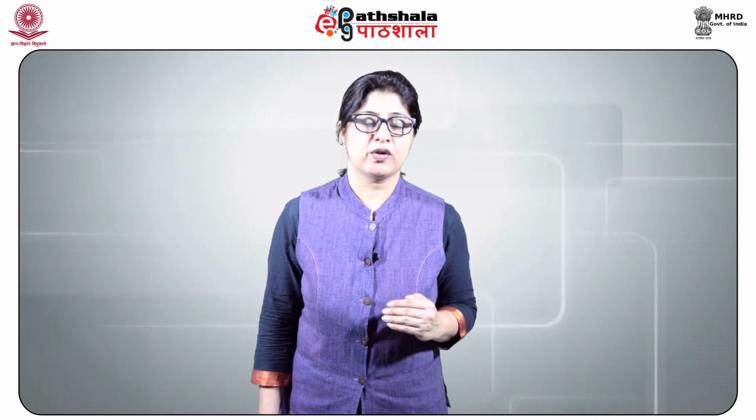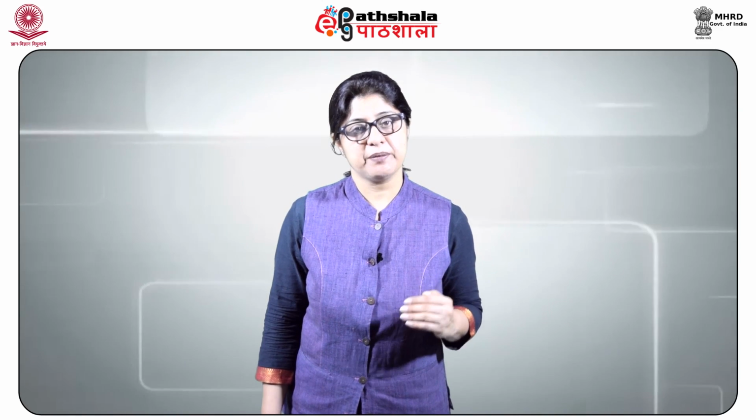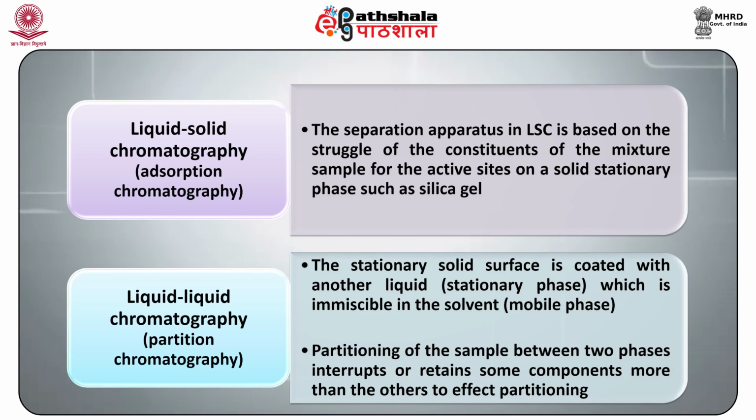Types of liquid chromatography methods. Liquid chromatography methods are named according to the mechanism involved. Liquid-solid chromatography, also called adsorption chromatography. The separation in LSC is based on the competition of the constituents of the mixture sample for the active sites on a solid stationary phase such as silica gel.